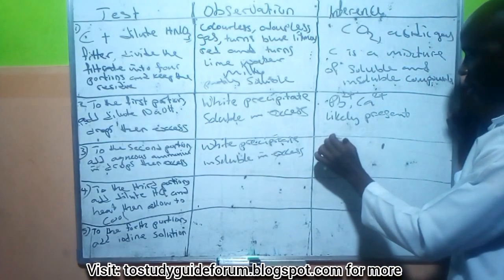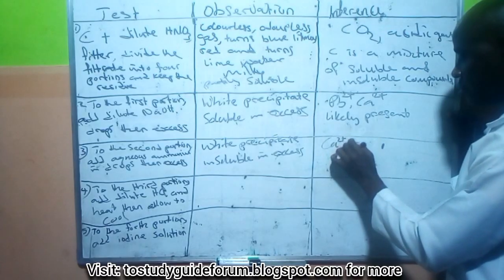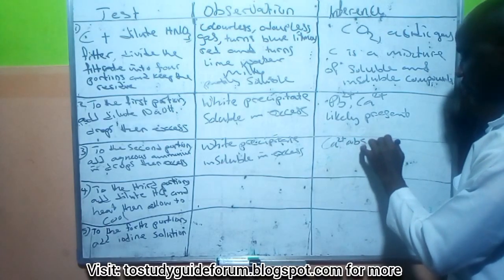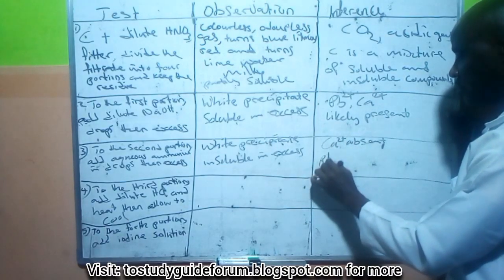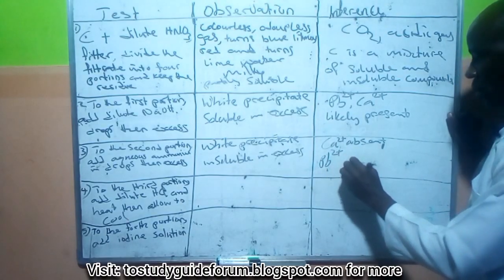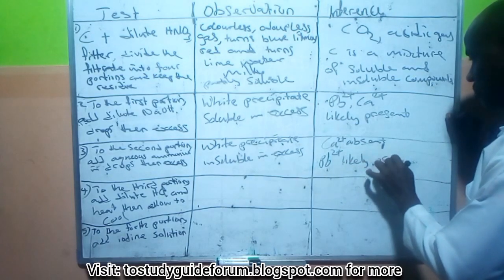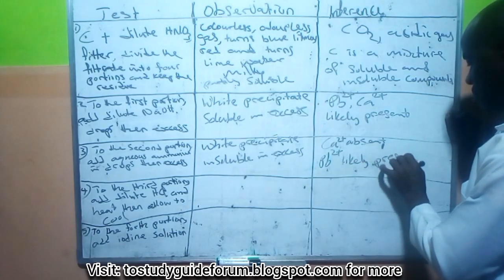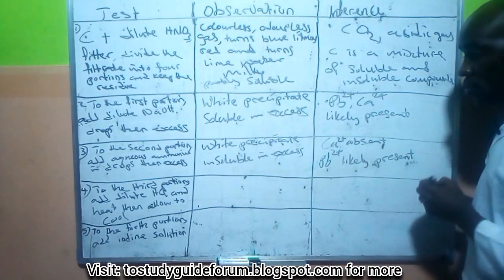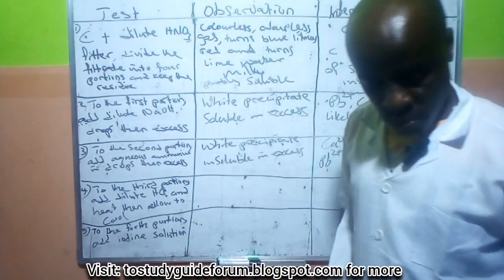So what we have here, calcium ion absent, lead(II) ion likely present.